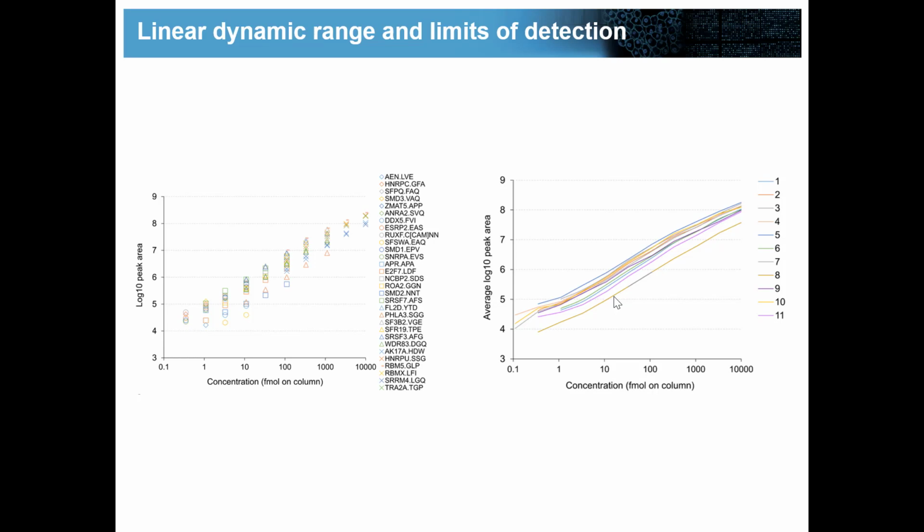And so I think Mike will talk tomorrow about doing DIA on trapping instruments more specifically. So I think in complex samples, the difference between the machines might not be that much, but for samples where you have low amounts of sample material or you have low complexity in the matrix, then you might get better sensitivity and more dynamic range using trapping instruments. I don't know if I answered the question there, or okay, we can talk about it later also if I didn't.